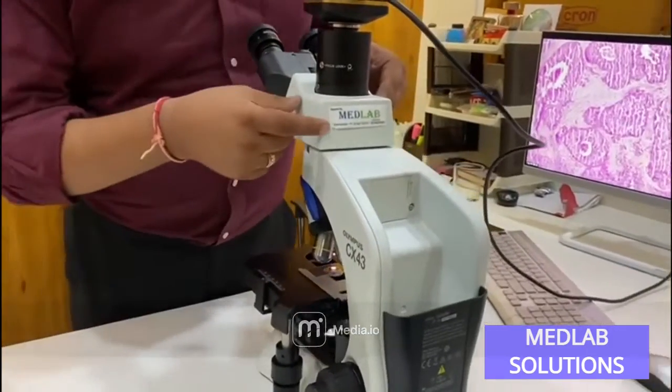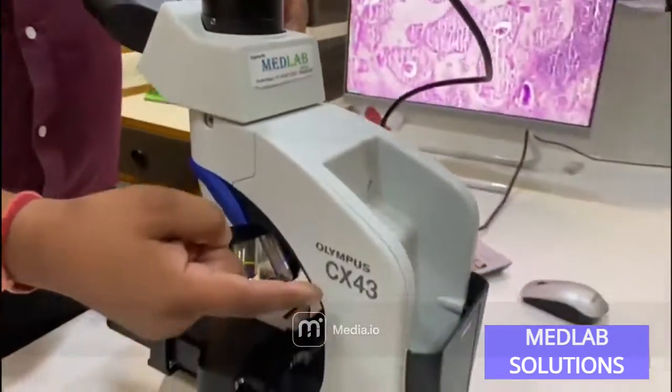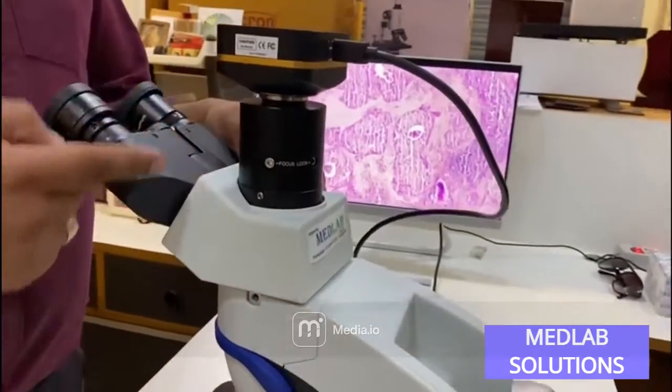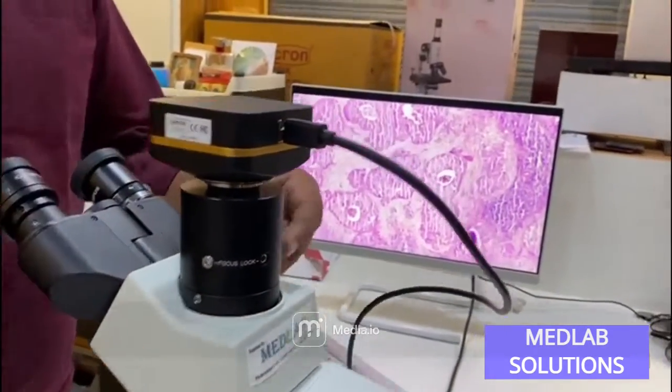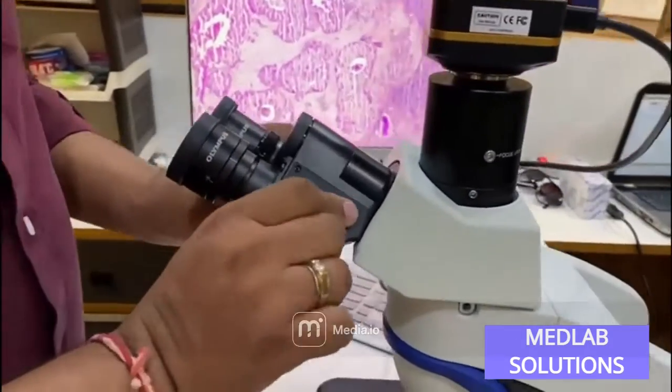Good morning everyone, we are from Medlab Solutions Hyderabad and we are representing today the CX43 Olympus microscope trinocular model, in which the camera is directly connected onto the C-mount. The features of this microscope are as follows.